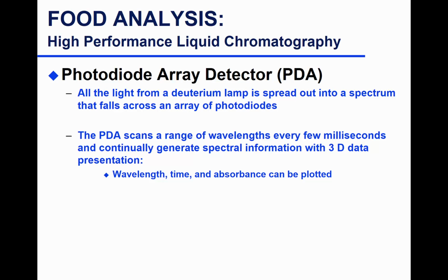So you saw that it has a unique spectrum where it doesn't absorb here at, let's say, 240, and it doesn't absorb at 300 or whatever. So you don't have absorbance here.